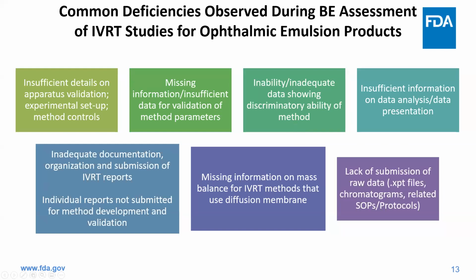Sometimes we see insufficient information on the data analysis or data presentation, especially when the data is not what we expected from the applicant. Sometimes the applicants just tend to submit all the data and don't provide a clear graph or clear presentation, so we can properly evaluate the IVRT study.